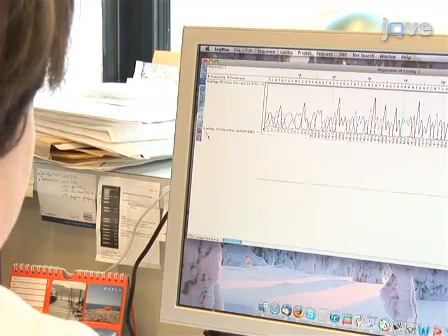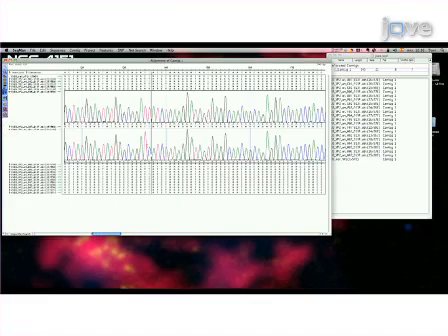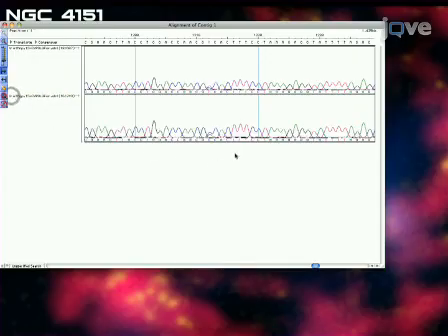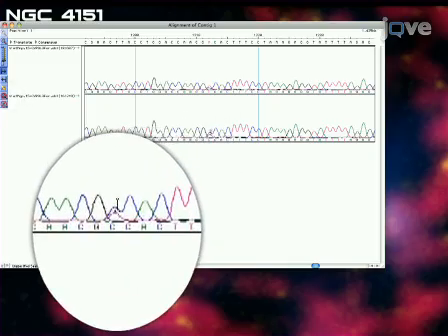Once the sequence information is obtained, use alignment software to align the resulting sequences with the reference consensus and identify the new point mutations. In addition, check the chromatograms for minority peaks that may have been missed by alignment software. A mutant representing 20 to 30% of the total population will still show as a peak, but too small to be identified as a mixed nucleotide by standard sequence analysis.